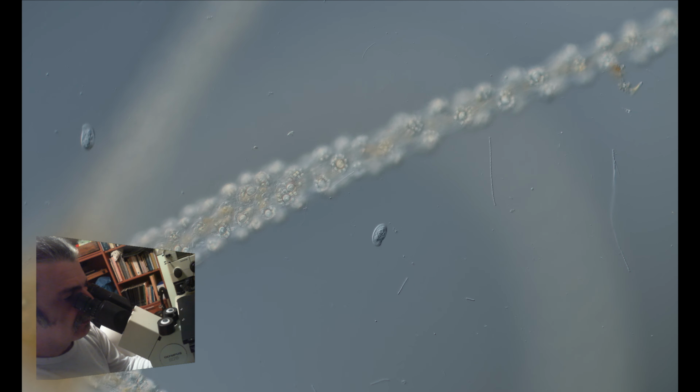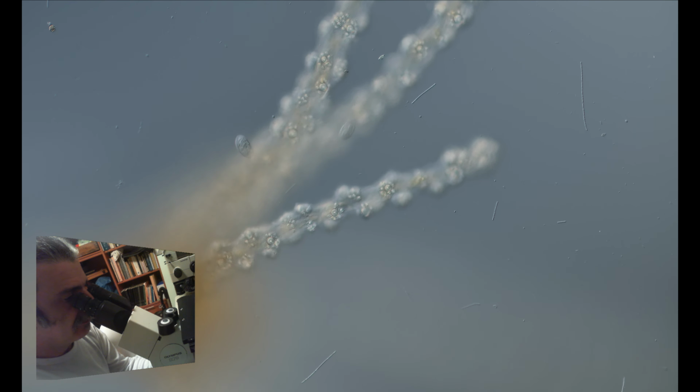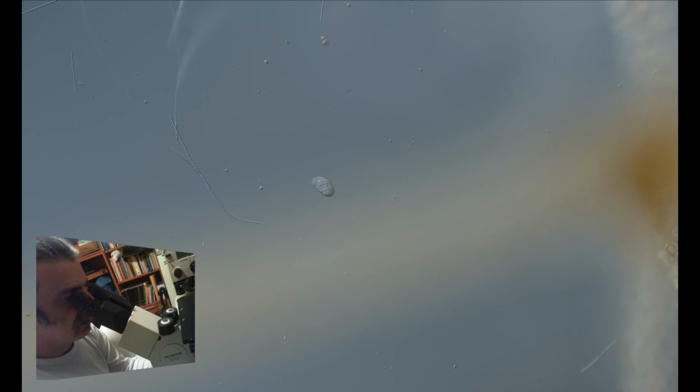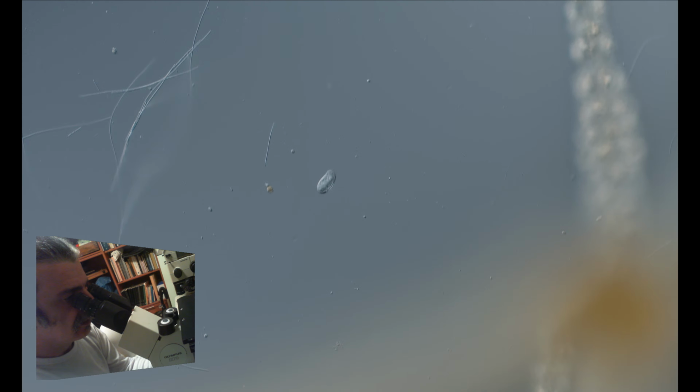It goes up and down, so it's not easy to focus on it. And here are very small ciliates from the Cyrtophorid class. We'll watch it later in more detail with the 40.